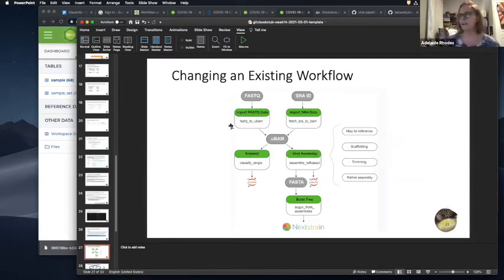Oh, here we go. So this is the existing workflow, where you can either import FASTQ data, so you may have private data that's not up in the bucket, and this would be the workflow you would use, or you want to use the public data, the SRA ID. We're getting thousands of sequences submitted every day, right? You can imagine the power of not having to do an extra step. If you're trying to append to your Terra table and keep going, it would be helpful to not have to do the fetch thing, if you just point at a bucket, right?